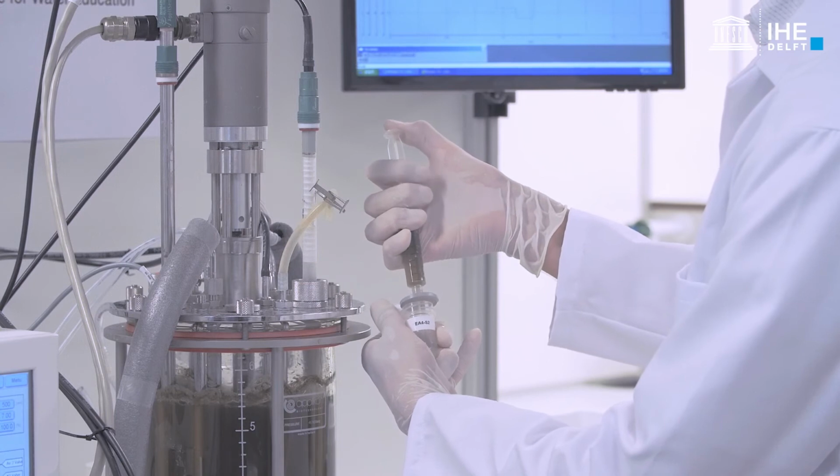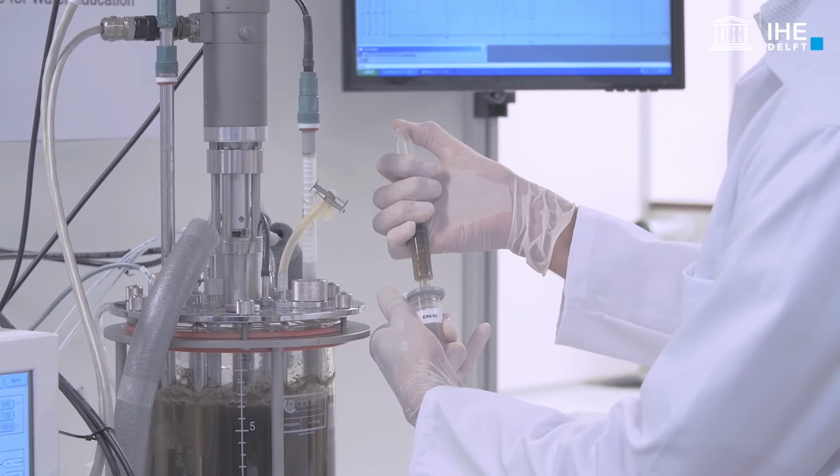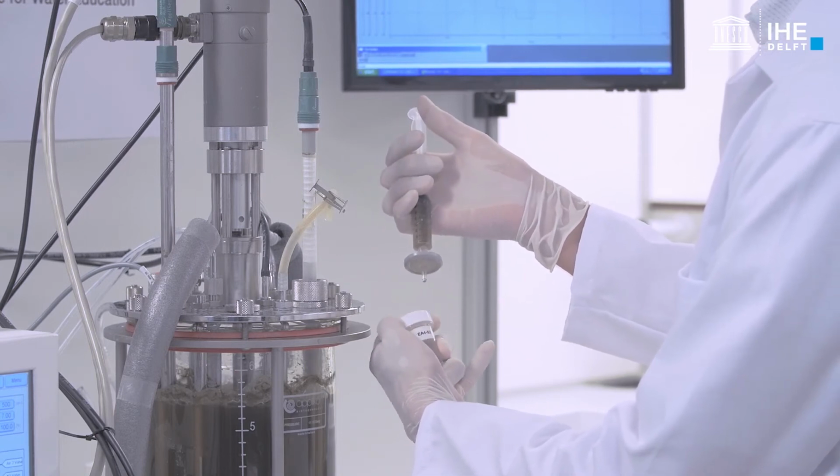To filter the samples at the time indicated in the sampling program will help in the correct determination of the kinetics of the processes.